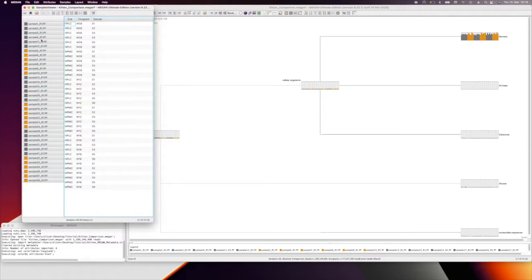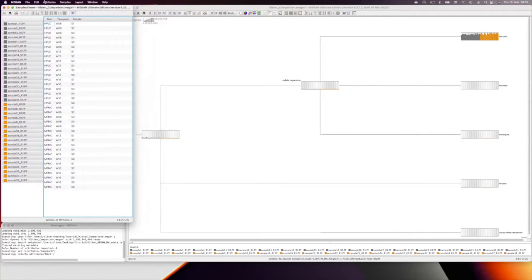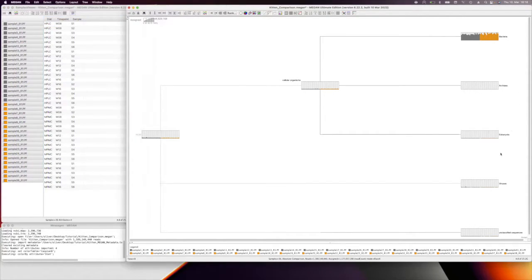And now we've got two colors here that are easily distinguishable, so gray and orange. And now what we can also do is sort by this column. And this makes it even easier. So here now we have one diet group on the left, the other one on the right. And this makes comparisons much easier.